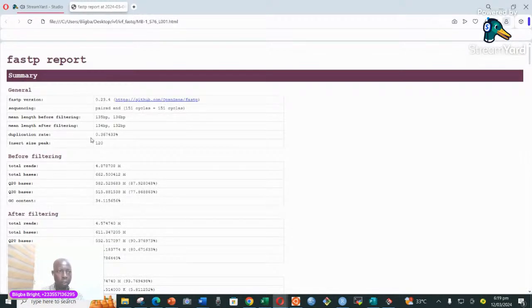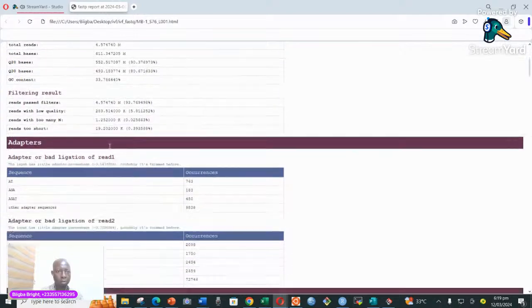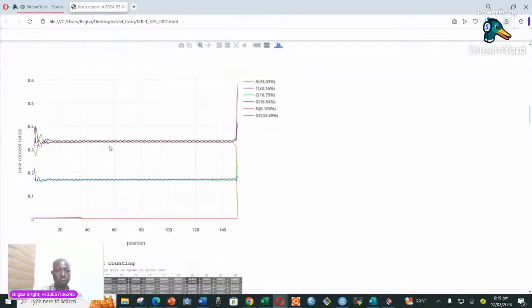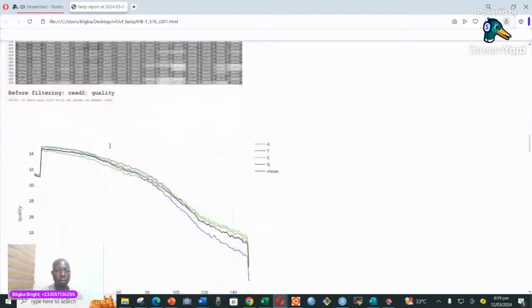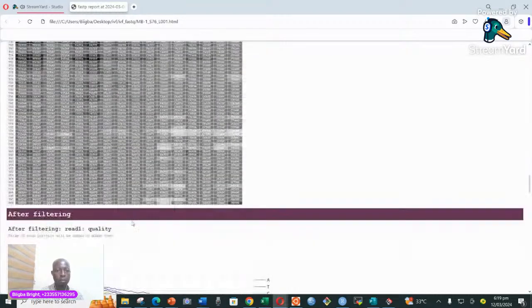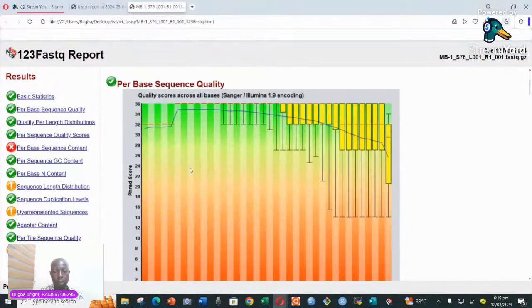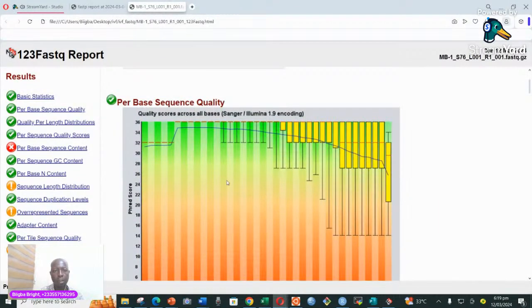It's taking a little while, and you can see these are the reports, if I'm not mistaken. As we can see the output, yeah, this is the S76. I also see another S76 here, but I don't know which one. I think this was it, yeah, that is it.